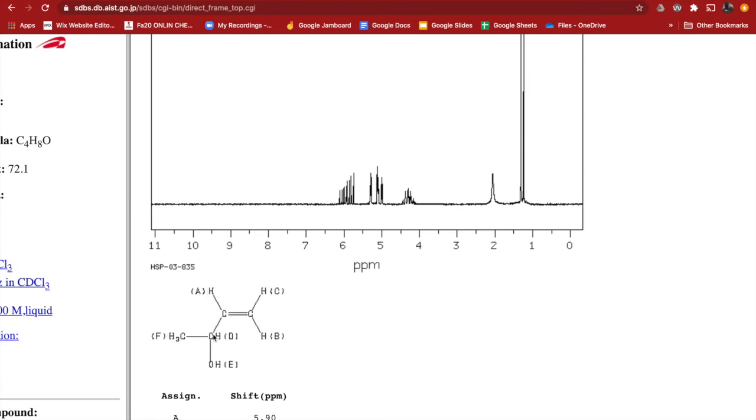That makes 4, and then 1, 2, 3, 4. Yeah, he sees that guy and that guy. Wait, there's a lot. He sees these 3 and these 3. So he sees 7 total. So he's looking like an octet. No, did I say 7 total? No, he sees 6 total. He sees these 3. 1, 2, 3, 4. Yeah. 1, 2, 3, 6. He sees 6 total. So he's a septet.